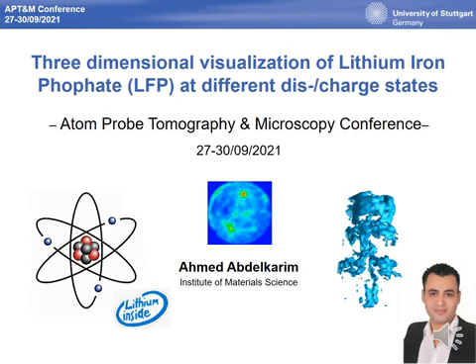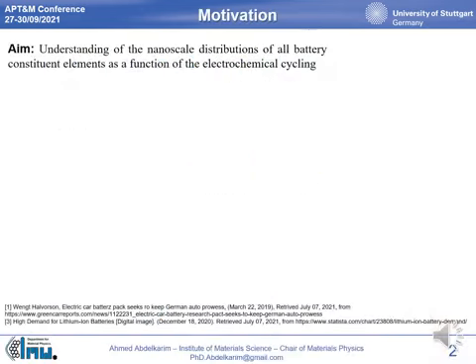Hello everyone, this is Ahmed from the University of Stuttgart, and now it is time to check the three-dimensional visualization of lithium iron phosphate at different charge and discharge states. The aim is to study the microstructure distribution of all battery elements as a function of the electrochemical cycling.